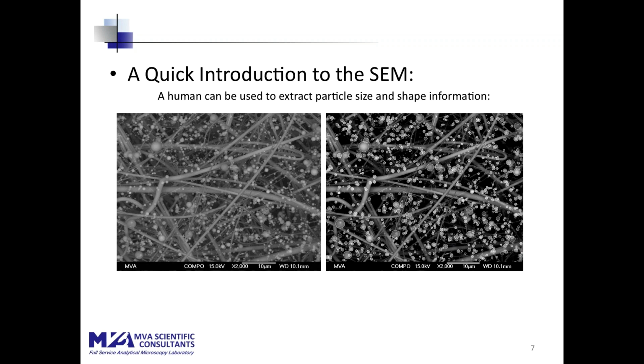Again, most importantly, size and average diameter. And that's what you see on the right, the result of someone manually defining and outlining the particles on this filter. So if we turn this tool to looking at method 201A catches, what do we find?